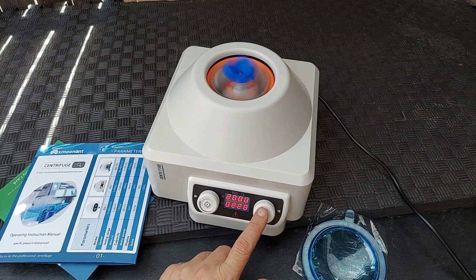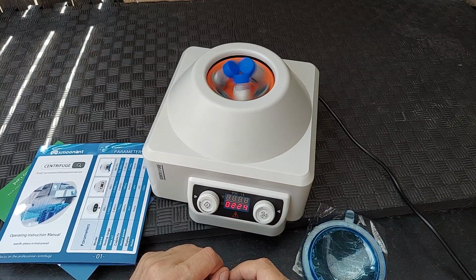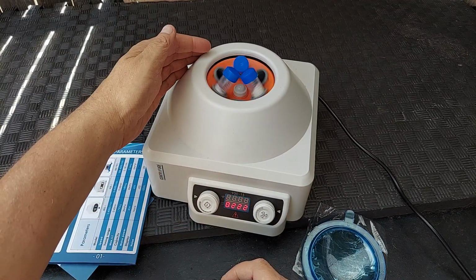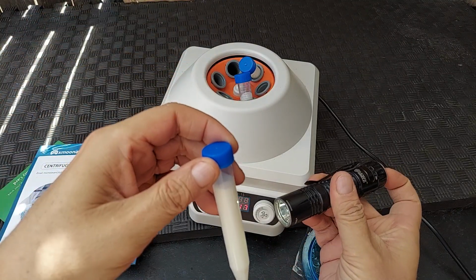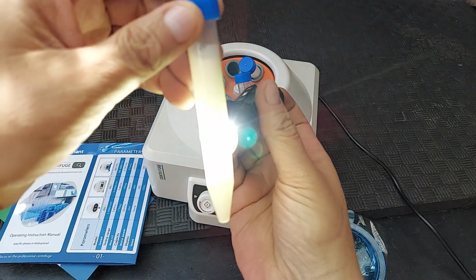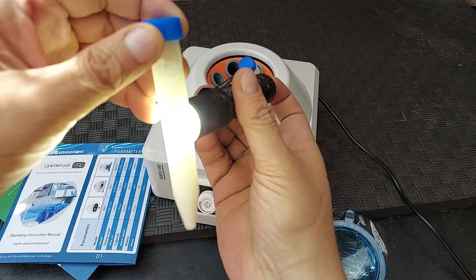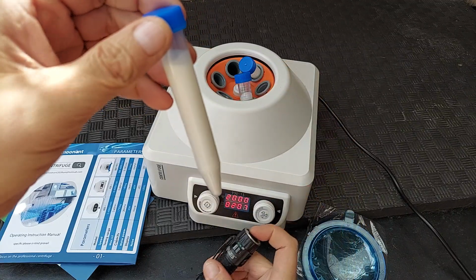Alright, so we've been going for a little while. Slow it down. Once it's stopped, pull one out, and let's take a look at it with the light behind it. Now I think you can see that the solids are getting down here to the bottom, and the top is getting clearer and clearer. Pretty neat.